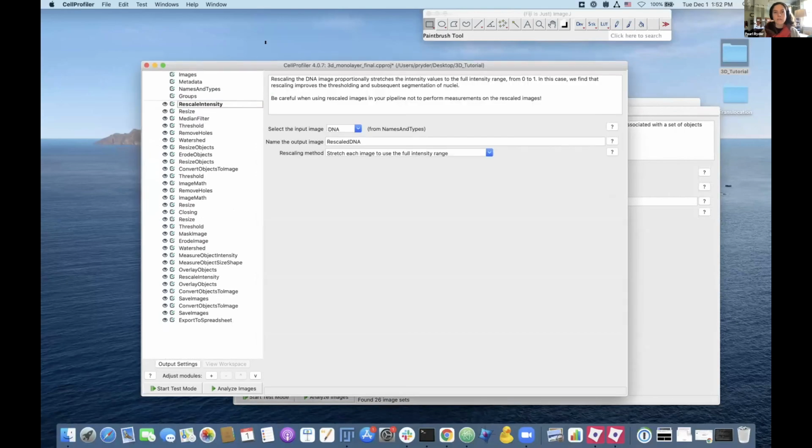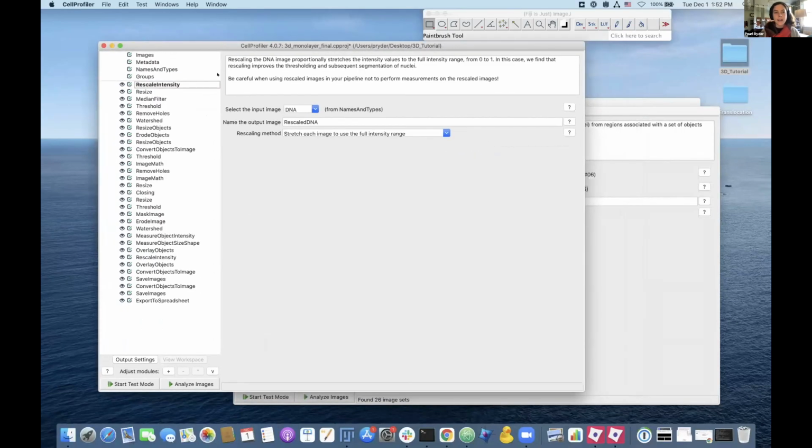in monolayer. Okay. So since there wasn't time to go ahead and finish the module, I just want to share my screen here, and I can demo and show you the full pipeline and the instructions. Hopefully you'll have some time to finish it out and keep working on the pipeline. We hope that the rest of the instructions should be pretty straightforward to do on your own.